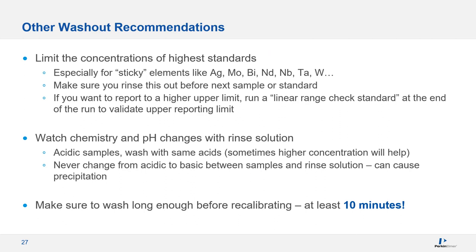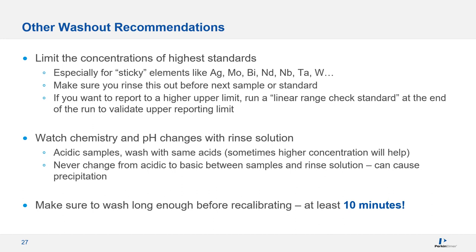There are some other important ways to reduce washout issues. You don't want to calibrate any higher than you need to, particularly for sticky standards like silver, molybdenum, tantalum, and tungsten. If you want to report to a higher limit, you can always run a linear range check standard at the end of your run to validate the upper reporting limit. You want to make sure that you rinse adequately before each sample or standard. And you want to watch for chemistry or pH changes with your rinse solution. So with standard acidic samples, you'll wash with the same acid or acids as are in your samples. Sometimes it's helpful to use a higher concentration of those acids in your rinse solution. You never want to change from acidic to basic matrices between samples and rinse solution. This can cause precipitation or salts to form. You want to make sure that you rinse long enough before recalibrating if you fail a QC check. At least 10 minutes.